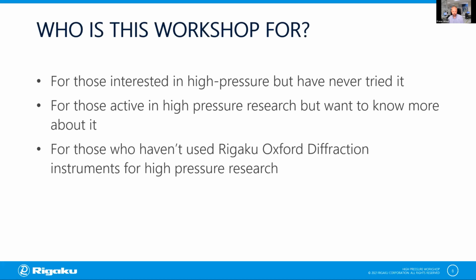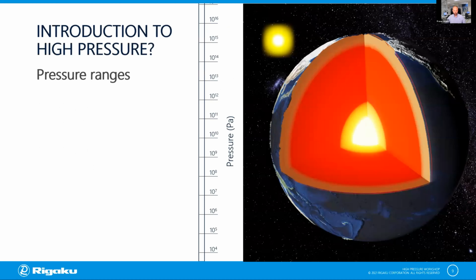And if you've done high pressure research on other vendors' instruments, then again, hopefully you'll see how things work on our side of the fence and be able to translate those ideas across and use our instrumentation. I hope not to tread on the toes of my colleagues and our invited speakers too much during this presentation, but my job here is to try and give you a flavor for high pressure research and what it can be used for.